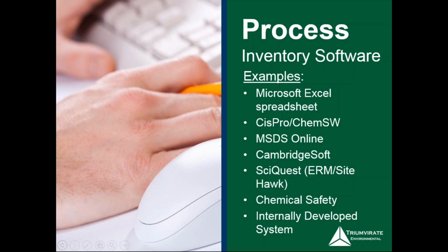And then there's also internally developed systems. So these are ones that are developed on-site, specific for your site. They can be very resource dependent and can get pretty expensive, and you have to have a really good IT capable person to manage that. So those are the cons, but the pro is that it gets designed specifically for your site and what you need it for, so it's highly customizable.